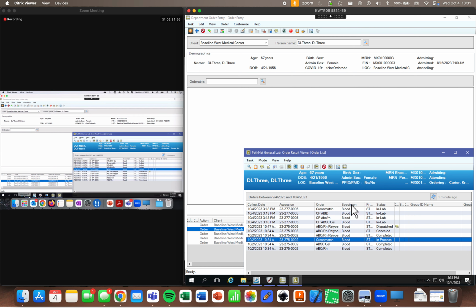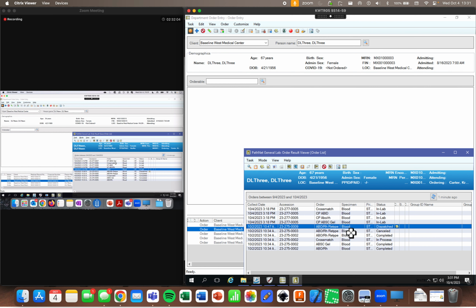That's what we want. So on mine, when I did the DOE, in DOE, I did see, well, I thought I had seen the antibody screen, but it's not in yours. Well, you can go back in and just add it individually. That's fine. If it doesn't work a second time, well, then we'll have to do some more digging.